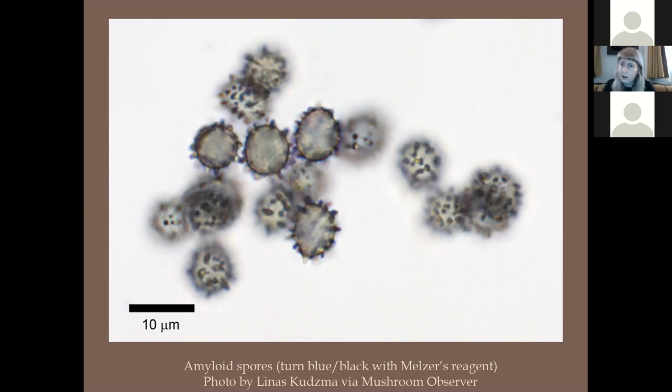AJ asks, are there mounting liquids that support a spore sprouting while allowing for visibility under the scope? You mean, are you worried about killing the spore with a liquid? Yeah, okay.